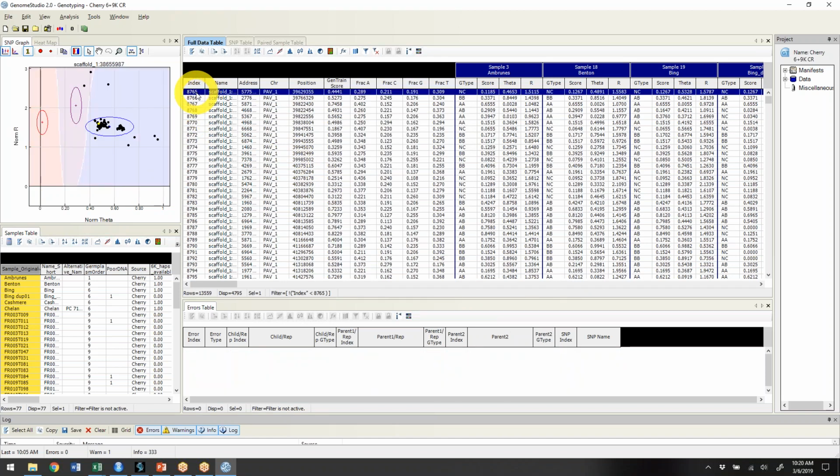It sounds like, I mean, it's just two little extra actions if you don't do this. And, well, during this curation, I looked at hundreds and hundreds of SNPs, so it really adds up in the end, and how quickly you can just move to the SNP you want. And again, this was a random SNP, and this is also not really a SNP that is performing well.